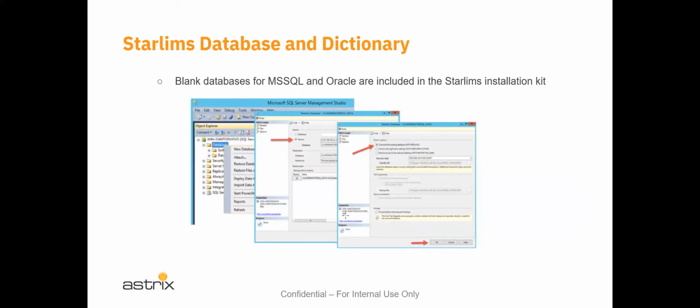But all the forms are there, the systems to install a new test, to create a new test, the forms that come up and allow you to create one, or modify additional components of a test, the analytes associated, for example. It allows you to create new users. All of the forms and the databases, the forms and the tables associated with those systems are contained within the standard installation.